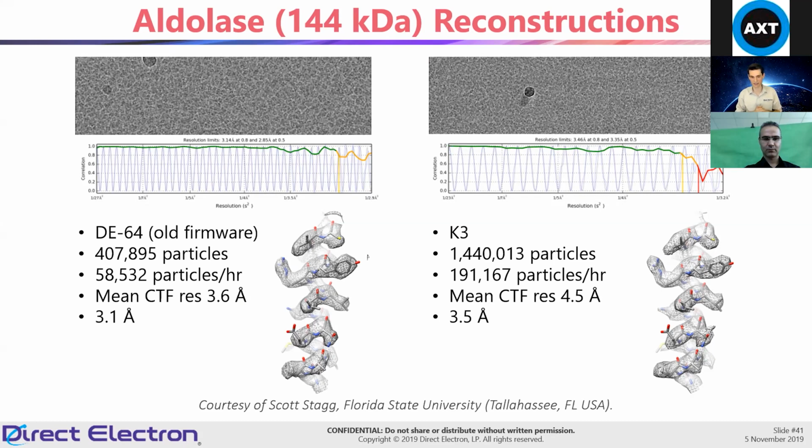And I think the mean CTF resolution for each image speaks volumes in terms of the performance of the cameras. Getting 3.6 angstroms on the DE64 versus 4.5 on the K3. So here's one of the very few microscopes that has both counting cameras and a good head-to-head study.